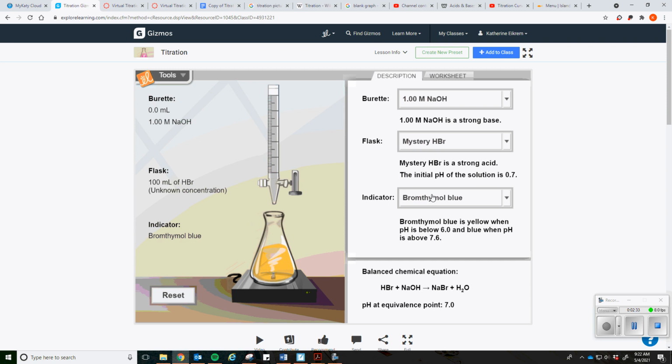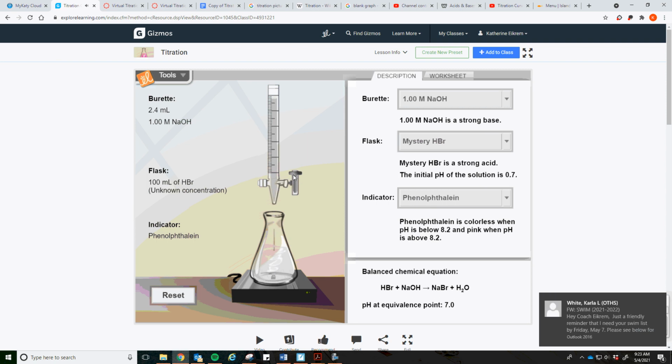So a little bit of how it works. I'm going to go ahead and make phenolphthalein just so that we can see this more clearly. So right here, we've got our titrant and our stopcock. And if I lift the stopcock from the bottom position, this is at rest, it's closed, to the halfway position, you'll notice up here in my volume on the left that I am increasing the amount of the titrant by 0.1 milliliters with every drop. So that gives you a good idea of how much is being added. If I was to move the stopper up to the top here, you notice it increases at a much faster rate.